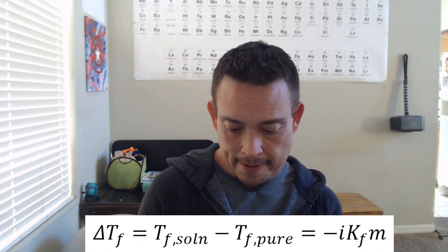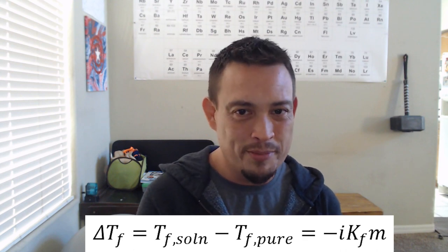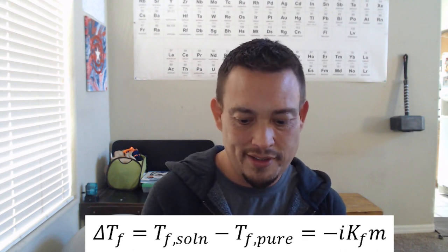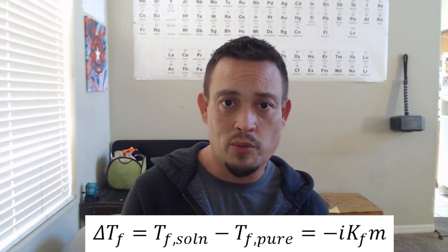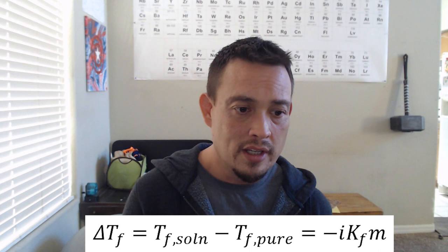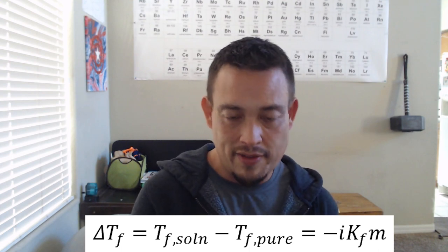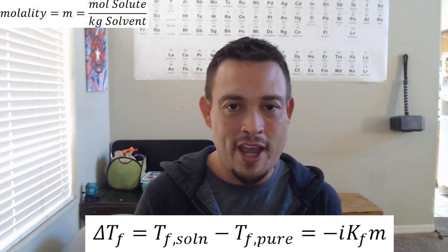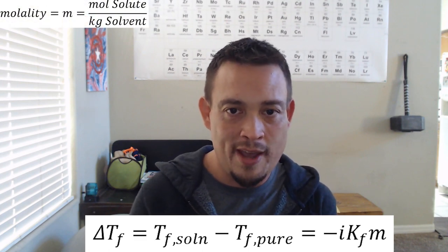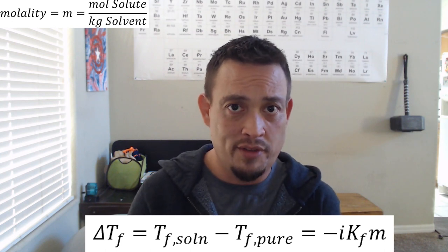We have the KF value, which is the one we're solving for today. This is the cryoscopic constant or more simply called the freezing point depression constant. This is depending on what solvent you're actually using. We're going to have a unique one here today for cyclohexane after the experiment. And then the last factor, which is very important is the molality. That's telling you how many solute particles you have per solvent, which remember is moles of solute over kilograms of solvent. So in today's lab, the moles is going to be naphthalene and then the kilograms of solvent should be the cyclohexane.